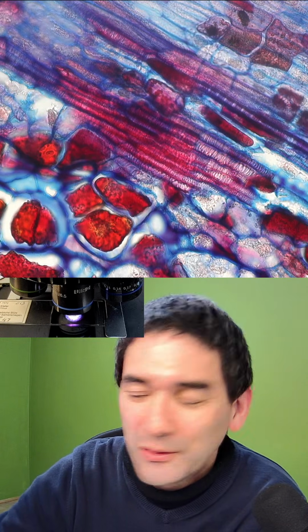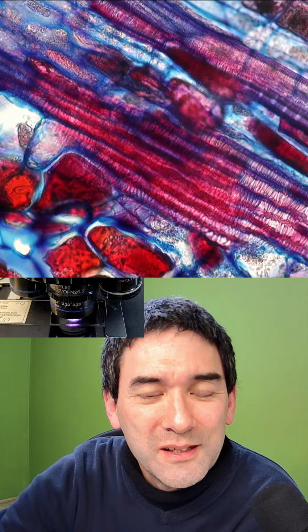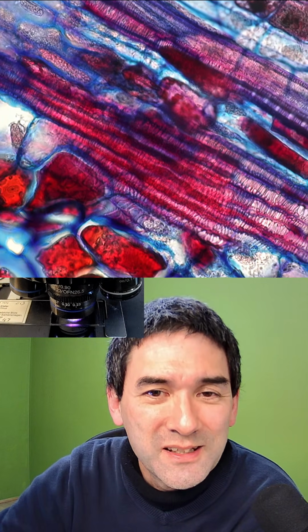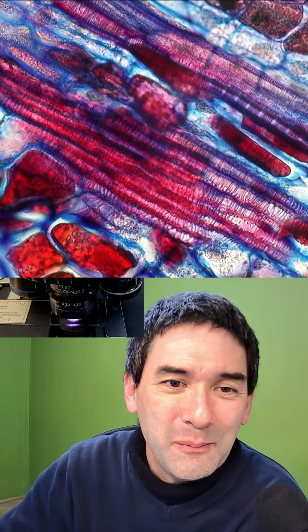Yeah, of course, here we are again, every week. I know you're already starting to feel tired of that. What is this? Those vessels that have these ring-shaped structures in the cell wall. Again, the xylem.